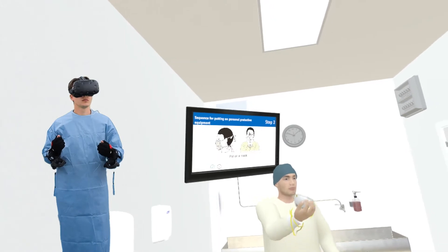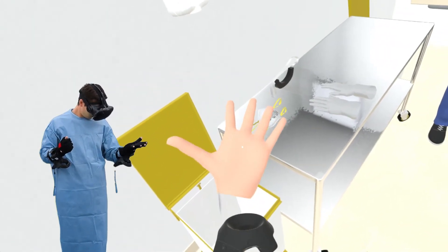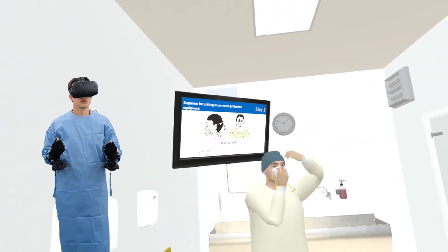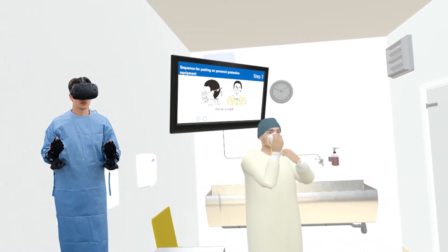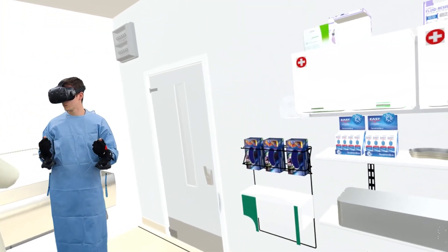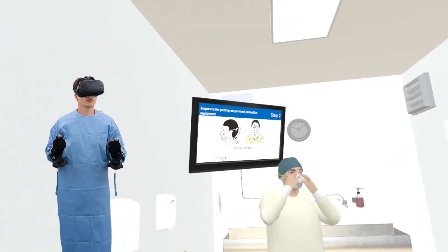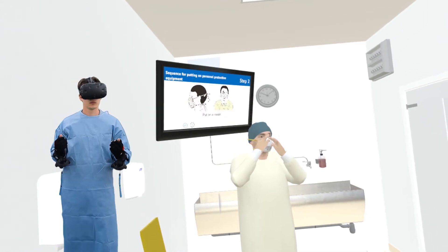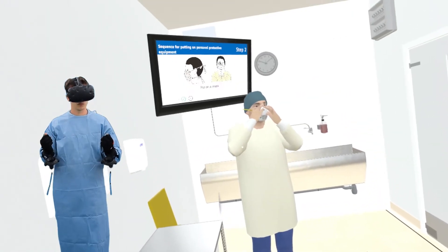Lift your chin and place your fit-tested N95 respirator over your nose and mouth. Stretch the bottom strap over your head and place it on the back of your neck. Ensure strap is on bare skin only — no loose hairs. Place the top strap on the crown of your head. Ensure that the straps are not overlapping or crossed. Check if the mask is properly formed to face. Ensure no folds by running fingers along the edges of the mask.